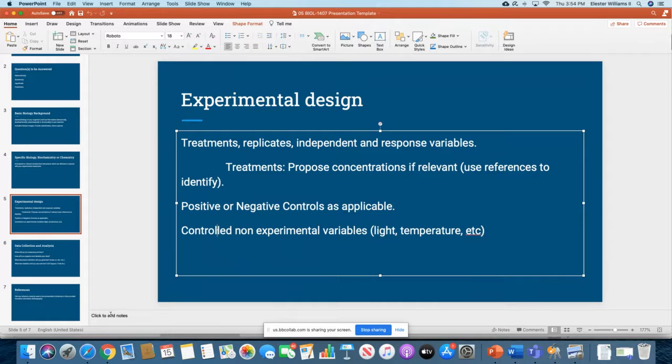So we didn't try to change temperature and add chemicals all at the same time, because it would have been difficult to tease apart the physiological changes, how heart rate was truly changed. And you can't really examine that statistically because you're changing many things at one time.